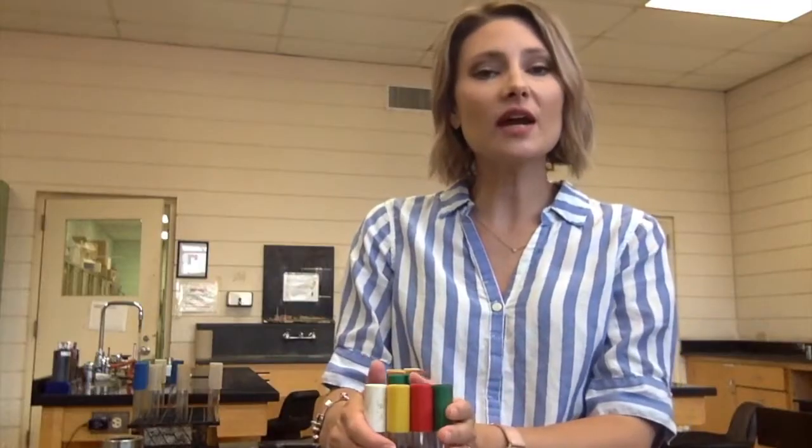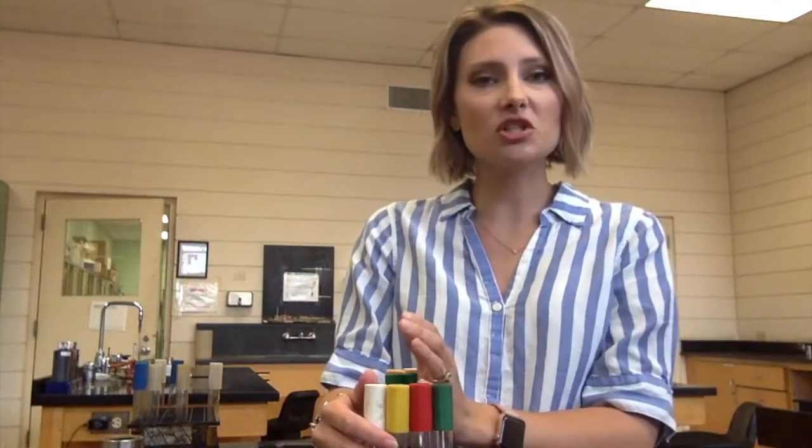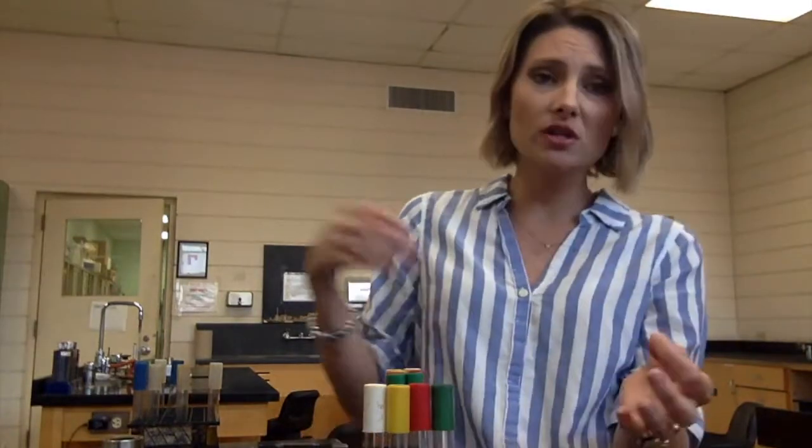The title of this exercise is Carbohydrate Fermentation, and we are looking to see which sugars your bacteria have the ability to ferment. Okay, so number one, does your bacteria have the ability to ferment at all? Some bacteria are non-fermenters. Pseudomonas is an example of one of those. It does not ferment at all.